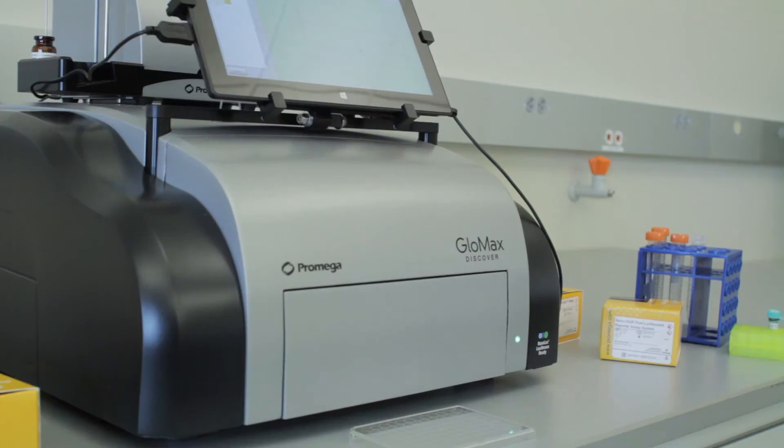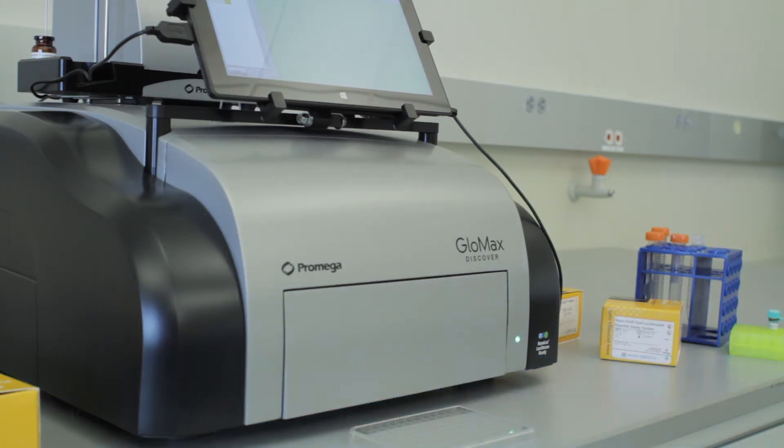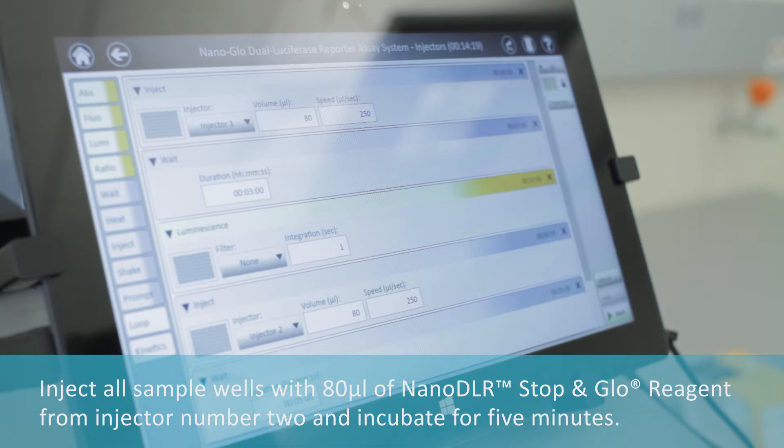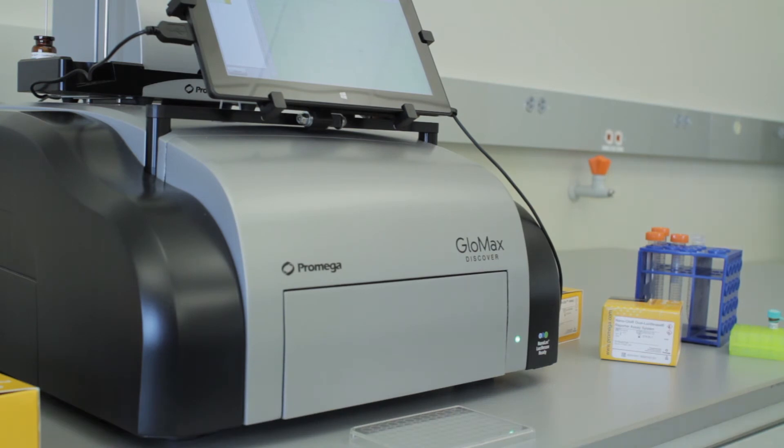Inject all samples with 80 microliters of One-Glo EX reagent from injector number one. Incubate for three minutes, then read firefly luminescence in all sample wells using a one-second integration time.